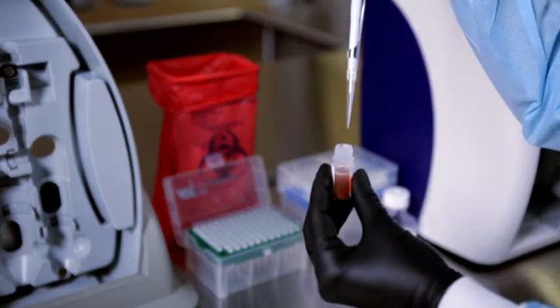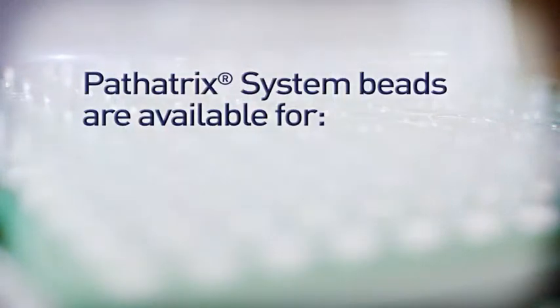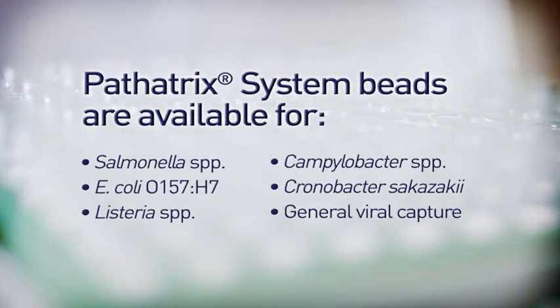Add the coated auto beads to the sample tube through the spout. Our standard beads can be used to detect a variety of common pathogens.